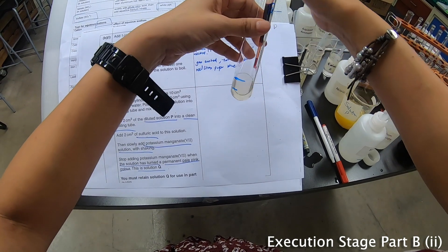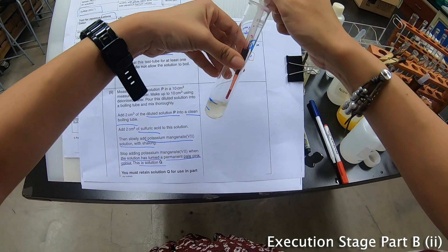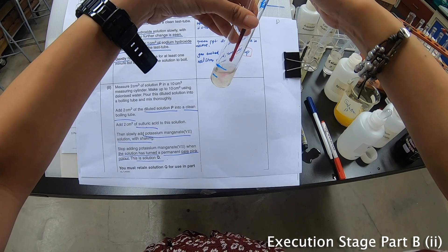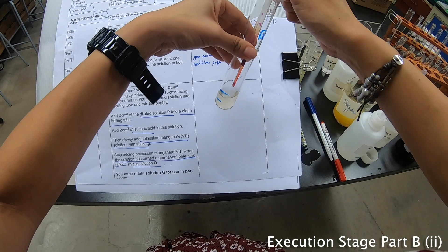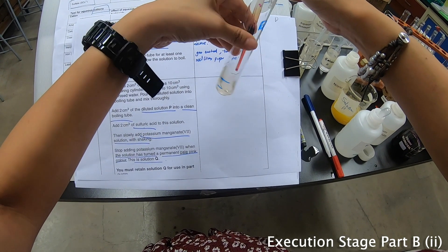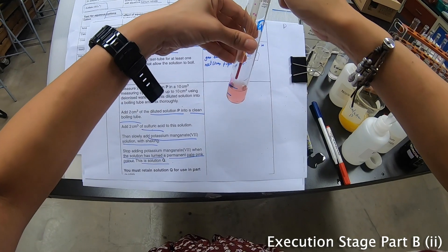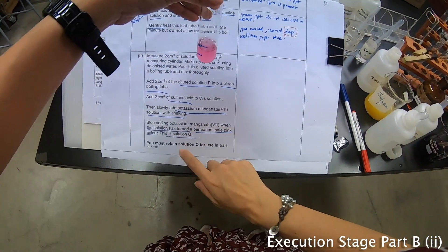Then add acidified potassium manganate — which is purple in colour — with shaking, and I have to add it drop by drop slowly until it becomes a permanent pink. Almost there — and a permanent pale pink. Very good.